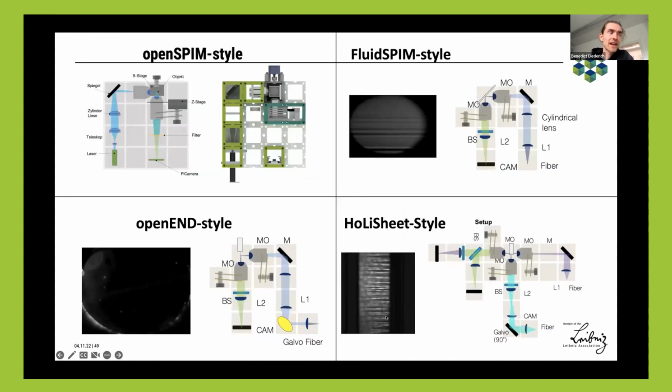We of course thought about, okay, let's try doing it with some kind of a light sheet system so that we can use the autofluorescent signal and then capture the 3D shape of the particle. And so there are different systems, of course, the SPIM, and then something where you blow the sample into the focus, or some vertical system here. But we want to have one more information. So not only the autofluorescence, but also the scattering by means of, for example, holographic detection. So we ended up with this here.